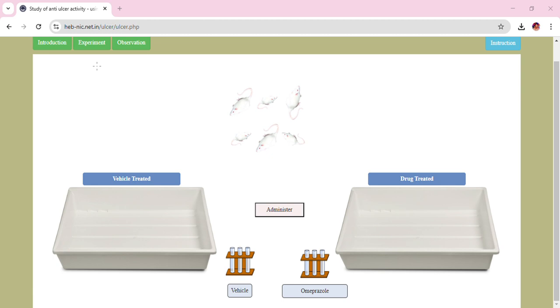After the esophagus, there is a cardiac sphincter. Then the actual stomach is divided into three parts: the fundus, body and pylorus. Near the pylorus and before the duodenum, there is a pylorus sphincter, and at the upper part there is a cardiac sphincter. Now we have to ligate this pylorus sphincter with the help of suture.